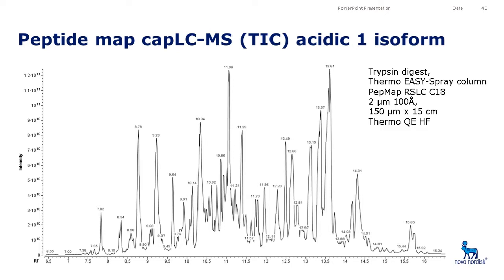It's just to show you that data, some nice chromatograms were able to come out of these analyses. So for sure the sensitivity is good enough, and due to the improved robustness of the CAP-LC, we will continue with the CAP-LC system rather than the nano-LC system.